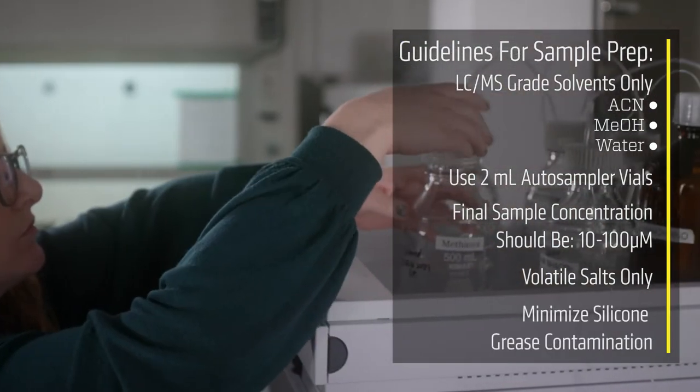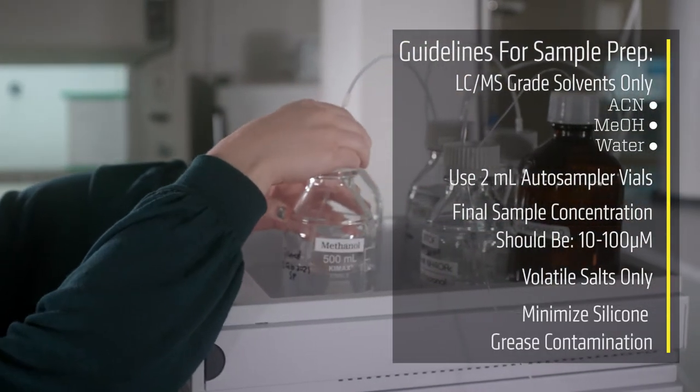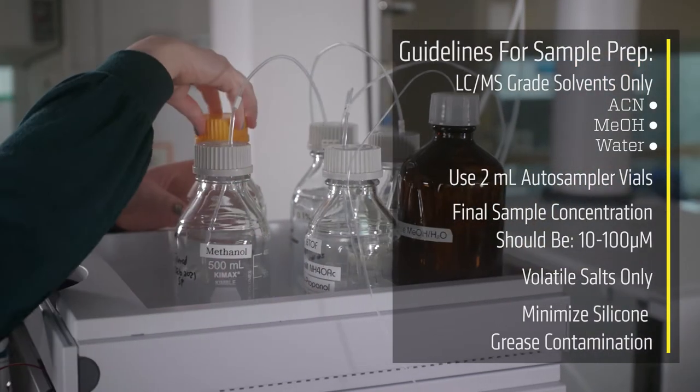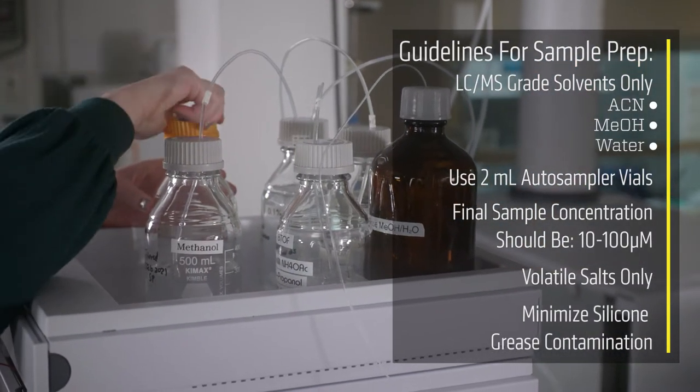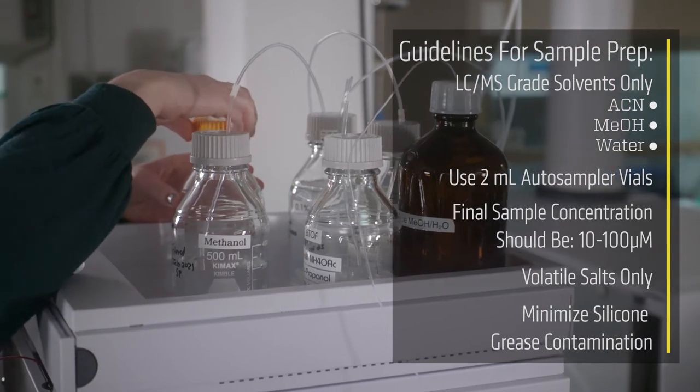Siloxanes from laboratory vacuum grease ionize exceptionally well, so please minimize contamination of your sample because it may contaminate the instrument for quite some time after your sample run.